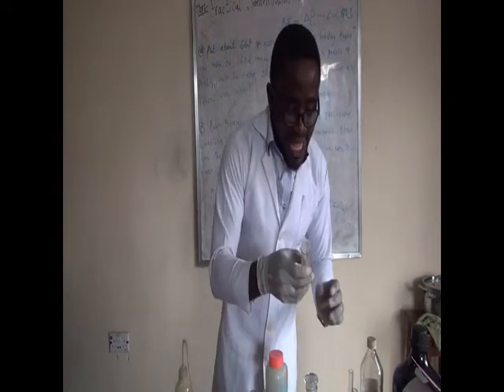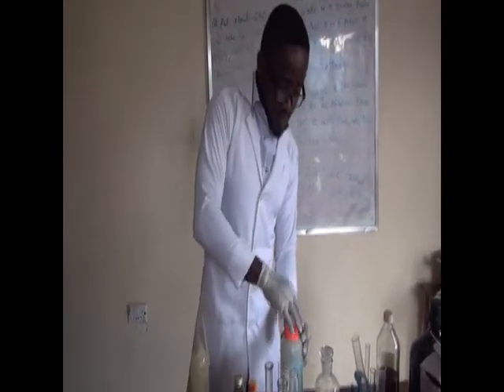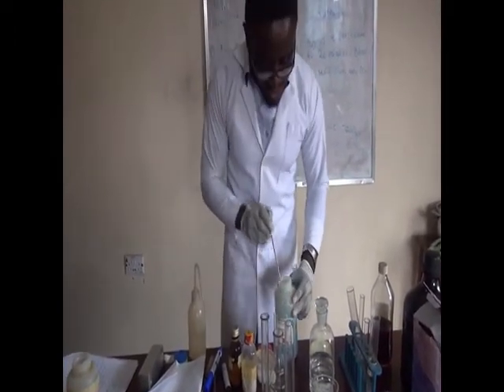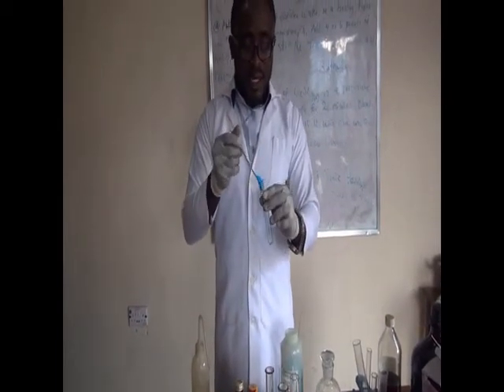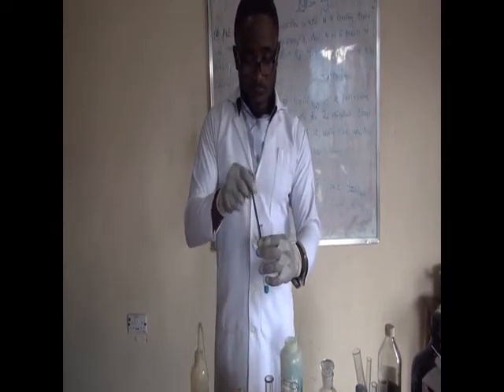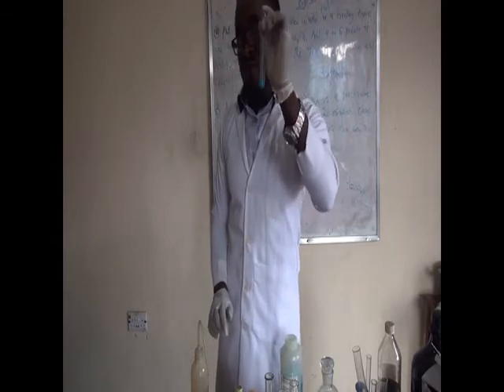Now this is the test tube. We'll take 5 grams of it. For those of you who are not familiar with laboratory reagents or solid samples, this is what it looks like. Now I will drop this in here. Though I've not measured it to be 5 grams, in your own session, try to measure 5 grams. Now I will use this and then we have to heat it.